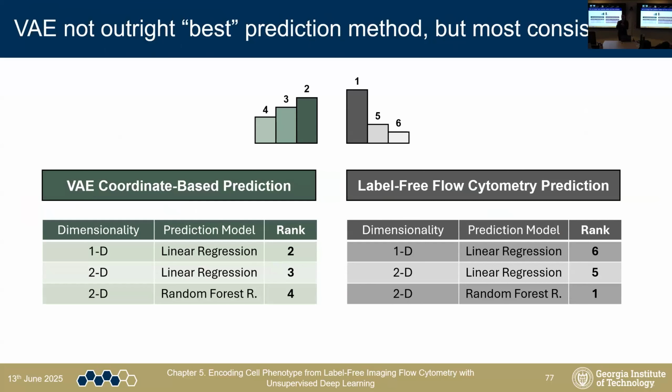There is one combination of pre-treating the data and using a specific type of fitting model where the flow cytometry comes out on top for the first one. But the VAE is the most stable and most consistent in that it's not really dependent on how you treat your data, what type of fitting you're using. It will give a good fit regardless.